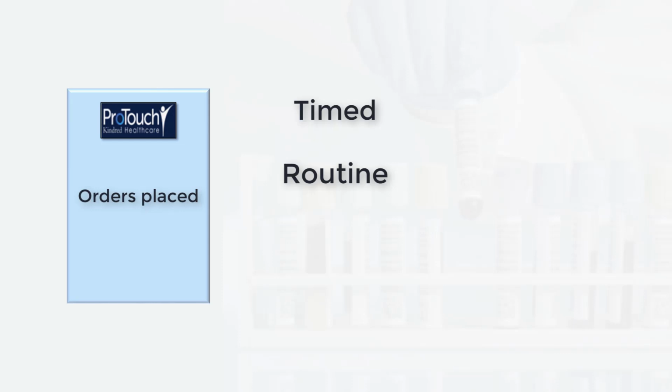Leaving the orders to default at the routine time will allow the SoftLab system to combine any duplicate orders. So for example, if you have one doctor who ordered a routine CBC and then another doctor orders a routine H&H, since the H&H is part of the CBC, the H&H will automatically be canceled by SoftLab as a duplicate order, and SoftLab will only print one label.